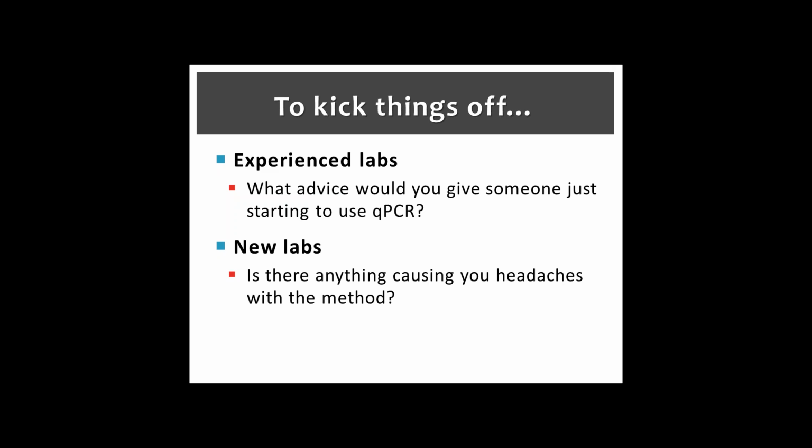Sometimes she'll get a result by QPCR that she just doesn't believe. And she'll go back to the sanitary survey and the other information that she has based on the models and say, this is the more reliable information. So there's a certain amount of weight of evidence, professional judgment. And I think as we explore this, we need to look at when is it really critical that you have that number? What do you do when the number just doesn't make any sense? You're going to have some fallback procedures. And so being prepared for that is pretty reasonable.